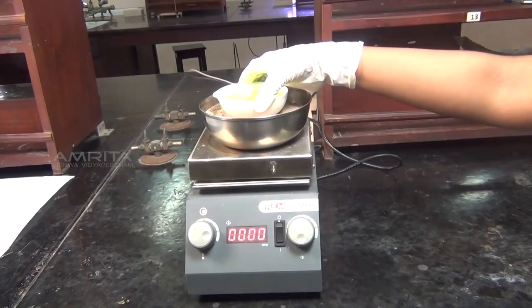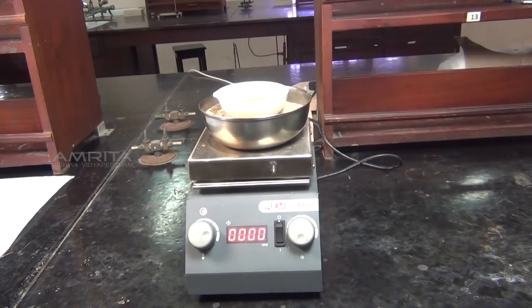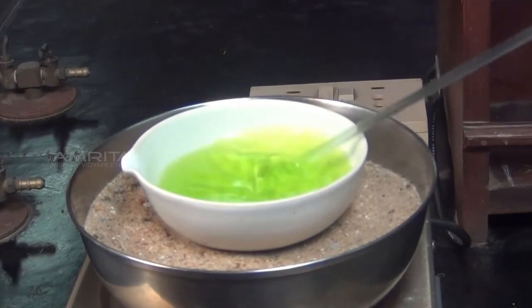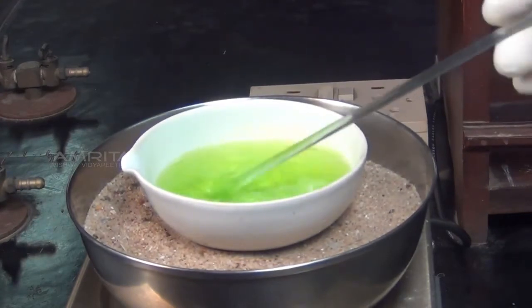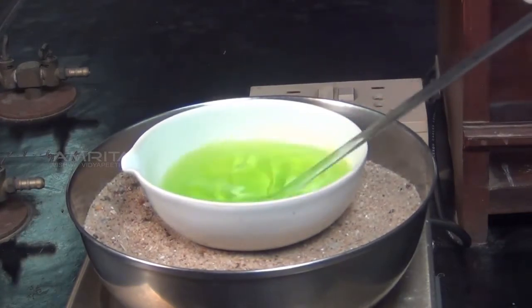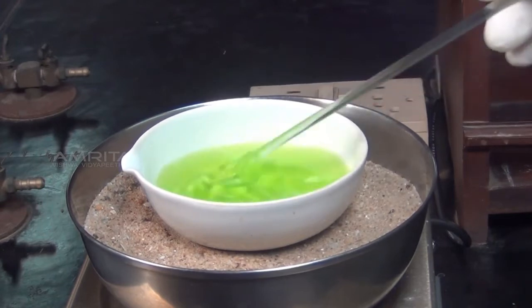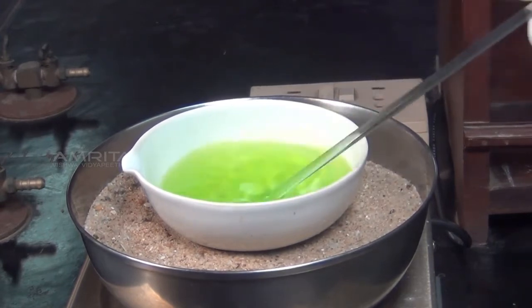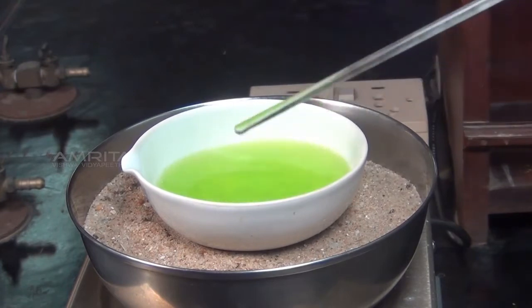Heat the solution in the china dish over the sand bath. To avoid crust formation on the side of the dish, stir the solution continuously with a glass rod. When the volume of the solution is reduced to about one half of its original volume, proceed to the next step.